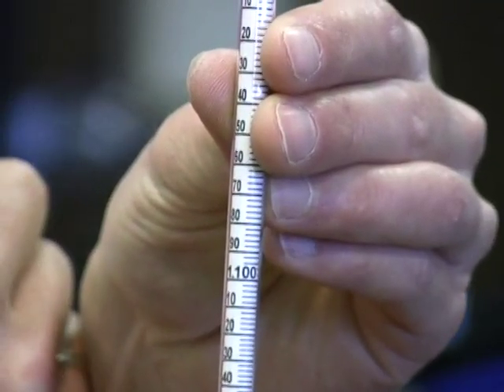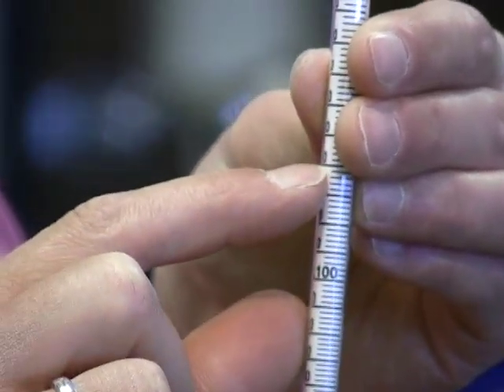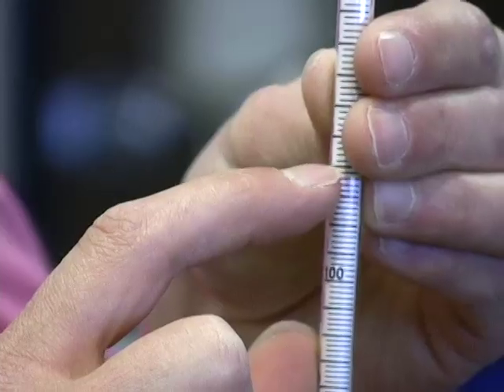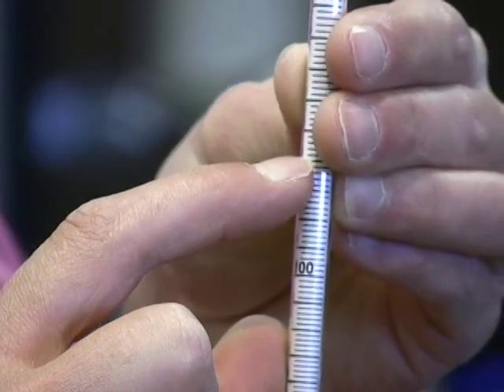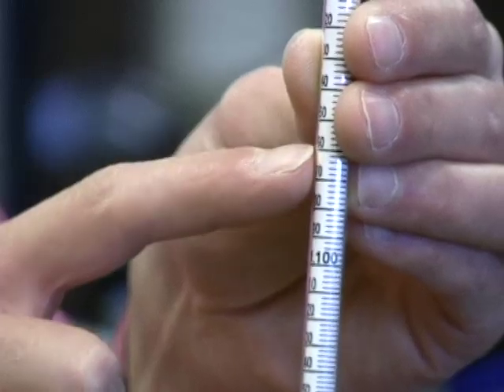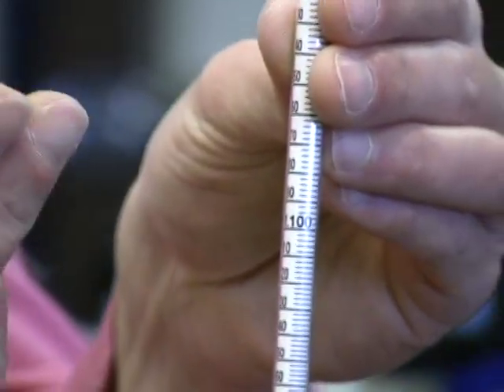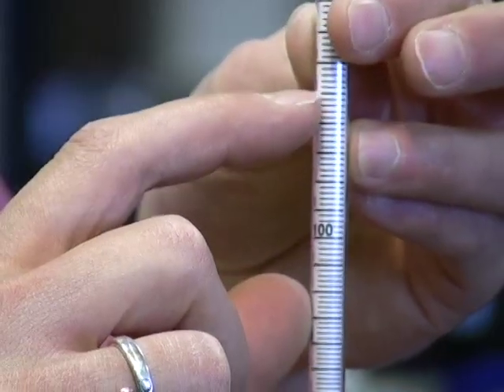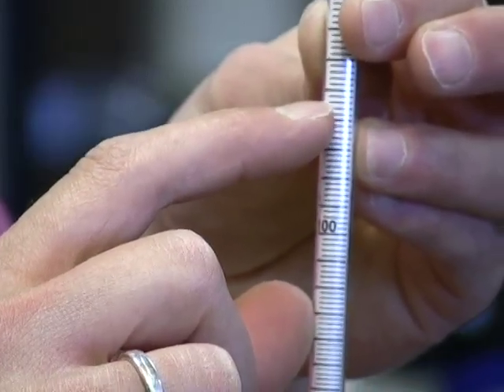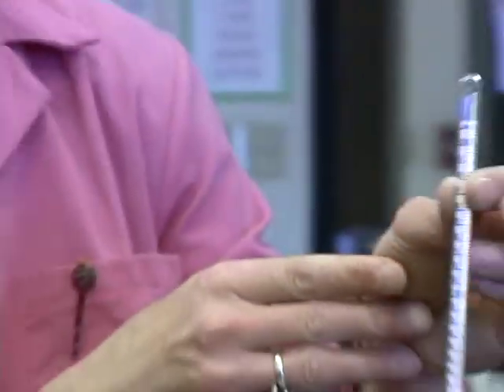When you go to read the hydrometer, remember that those are hundreds positions. If you look at the gradations in between — say 50 and 60 — those refer to the thousands position, and they're demarcated in increments of .002. So if your reading on the hydrometer is exactly evenly between 50 and 60, your reading would actually be 1.055. Or if it's one mark down from 50, your reading would be 1.052, and two marks down, 1.054, and so on. Hopefully this will help you read the hydrometer.